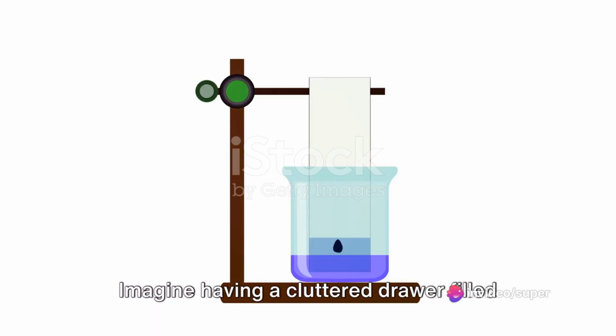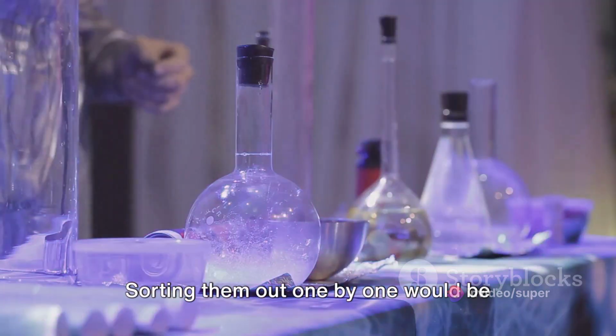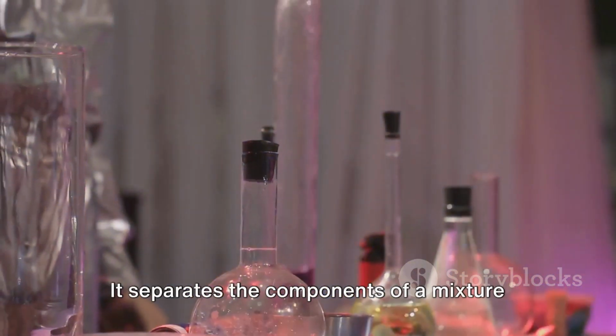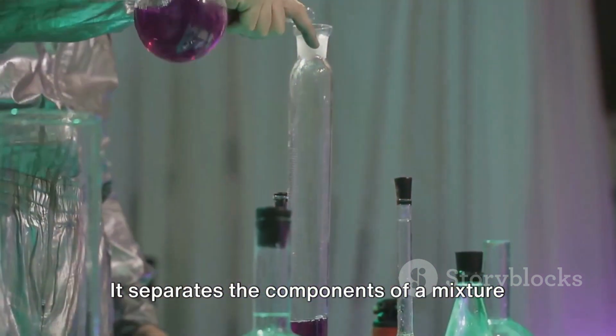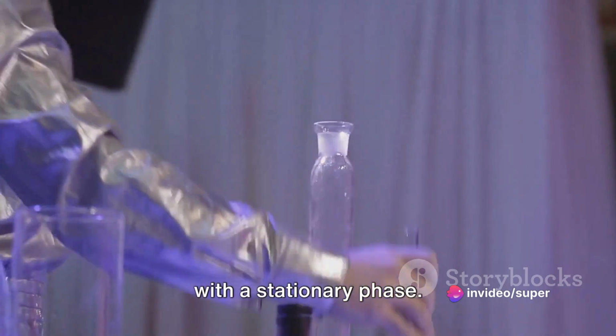Imagine having a cluttered drawer filled with a variety of trinkets. Sorting them out one by one would be quite a chore, right? Well, GC does a similar job, but for molecules. It separates the components of a mixture by exploiting their different interactions with a stationary phase.